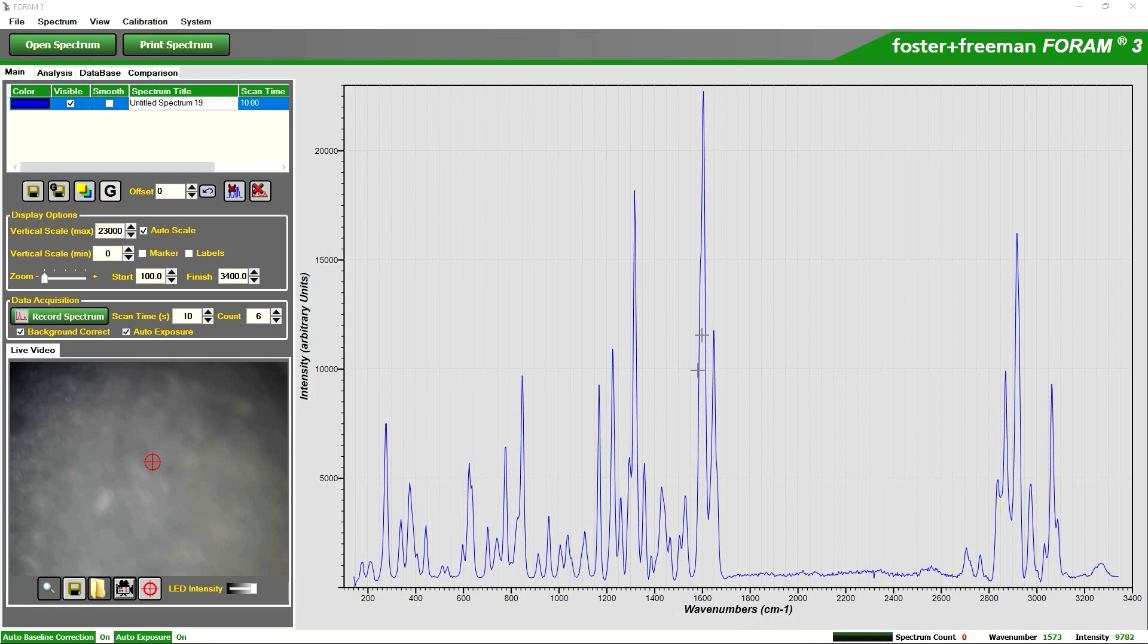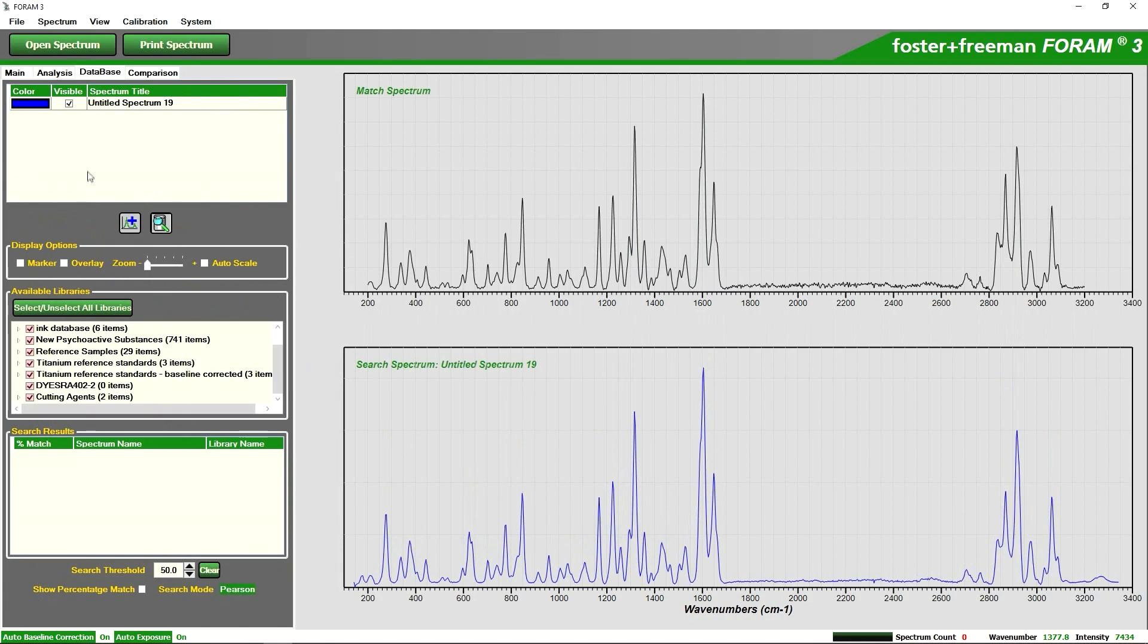Essentially what we are looking to do in this case is to try and identify this particular sample. If I click on the database tab, on this particular system we have a number of databases loaded. A number of them are for different cutting agents which we believe this sample might be.